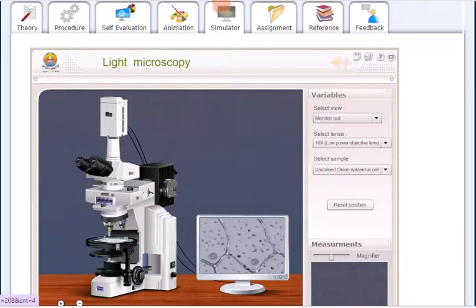All right, so this is the experimenting space. Then there are some tasks given, and there is also a reference book where you can refer about a particular bacteria or anything that you would like to read about the particular specimen. This reference book is available here. And now if you look, this is the light microscope, and there are variables that you need to change, and you can see how the bacteria look under the light microscope.